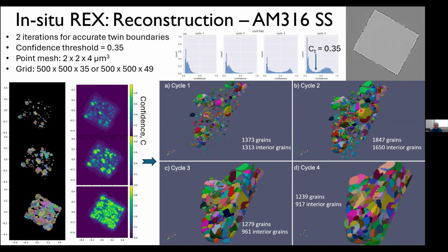And so you can make these wonderfully beautiful little maps of grains that are inside the material, but the rest of the material is deformed, while these guys have formed quite high quality single crystals.